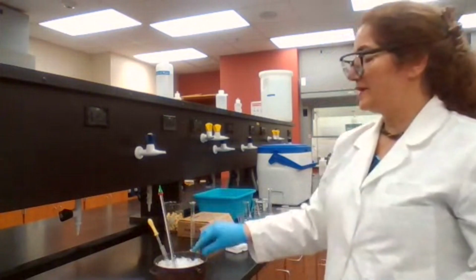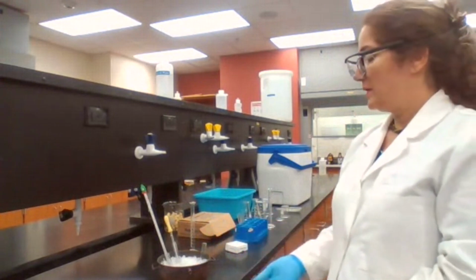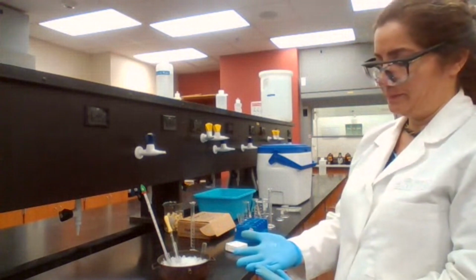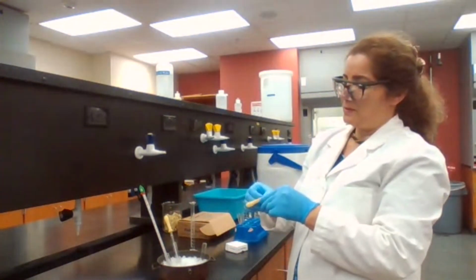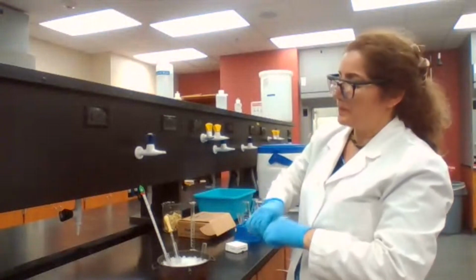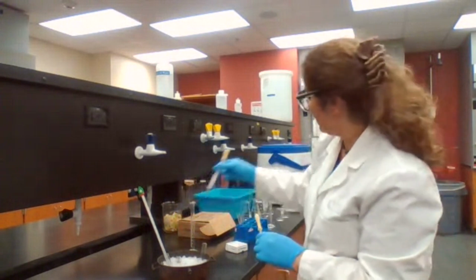That's why I use it. I'm going to wait for the 5 degrees Celsius temperature for the test tube before I add the nitronium ion. I'm using a new pipette for the mixture. So this is basically a discard. I don't need it.